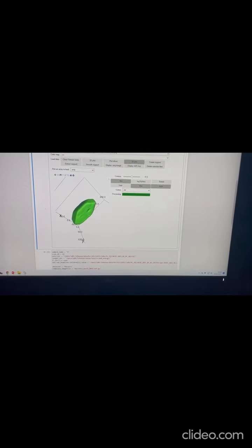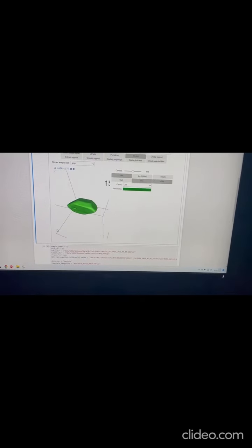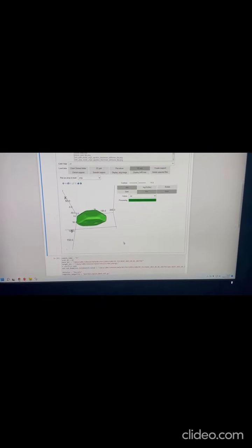We can also see the different dislocations of the crystal and hence get information about its coordination number, the stress on different parts, the structure of the crystal, and other information.